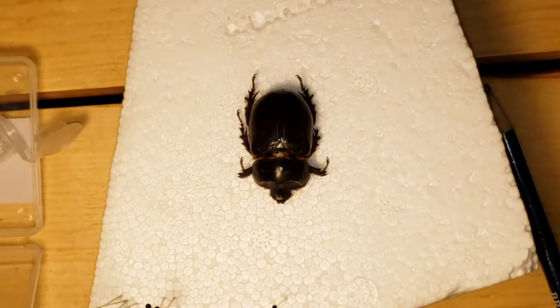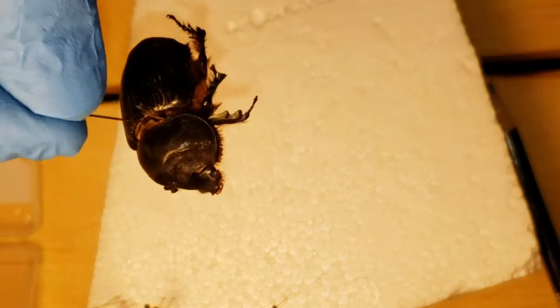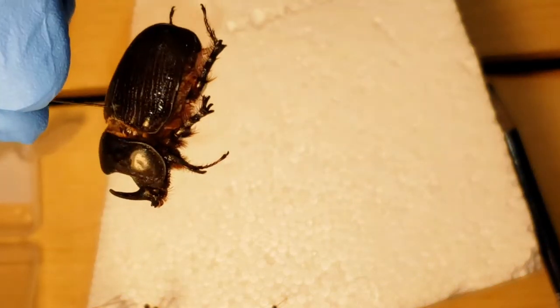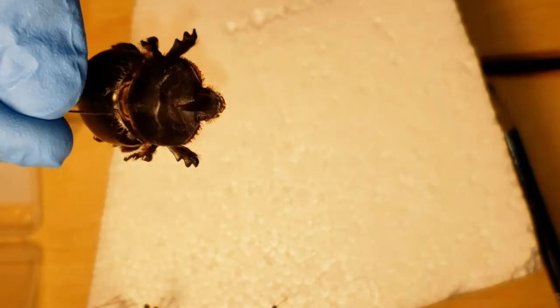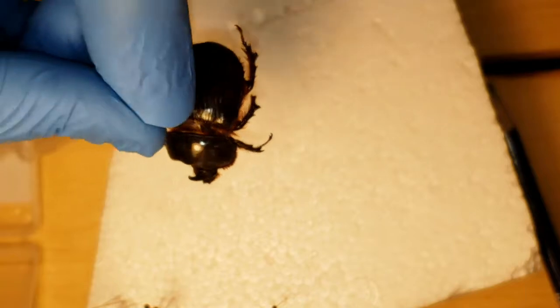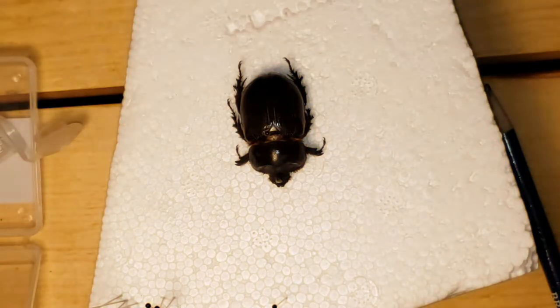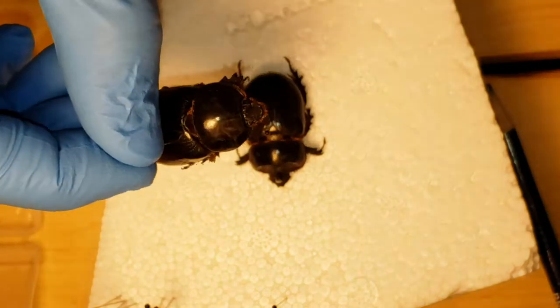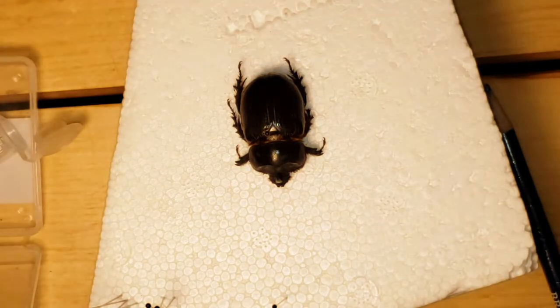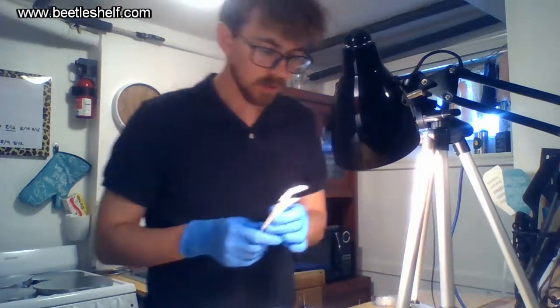Of Xyloryctes thestallis — it's a rhino beetle. Look how beautiful the horn is, it's a very nice specimen. Here's the female; females are a little bit larger. Yeah, we'll measure them really fast.